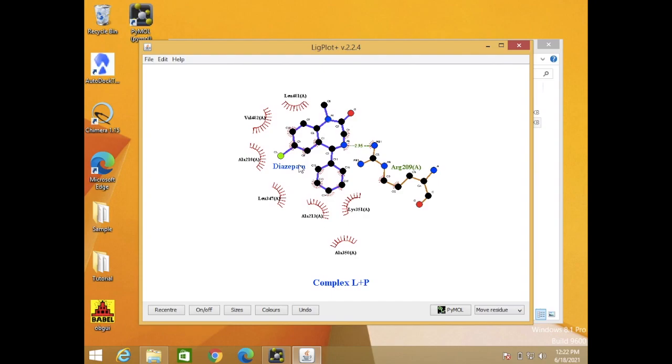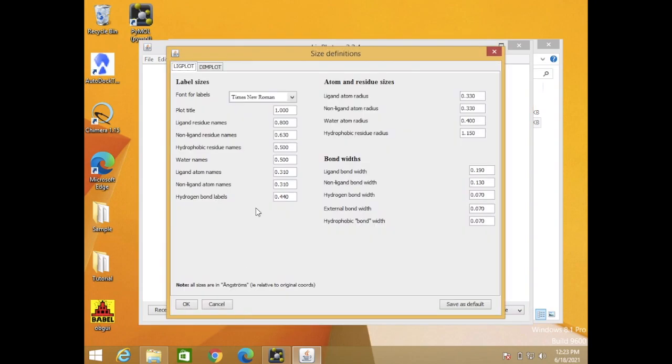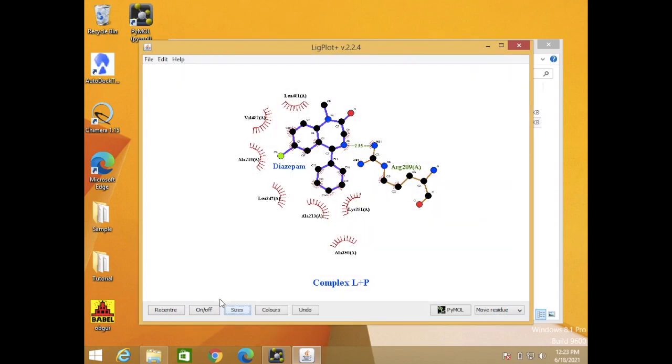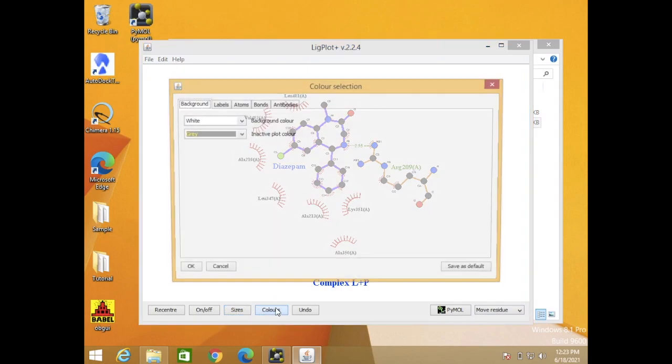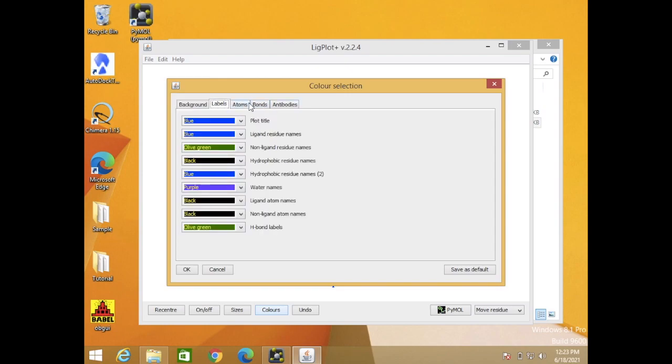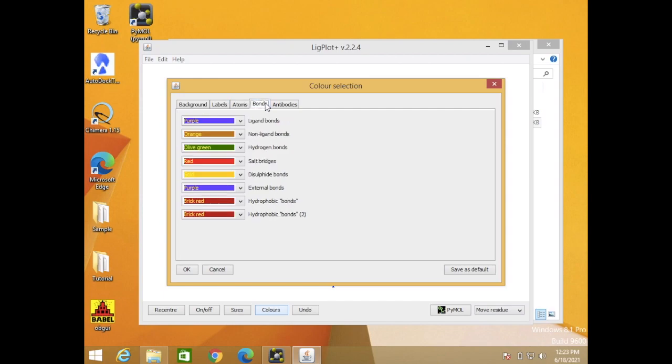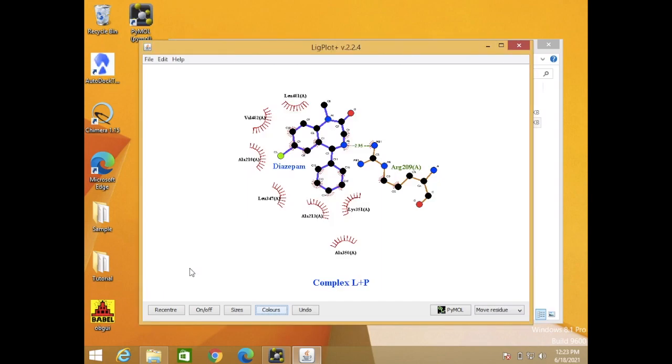For this structure, you can modify the size, the font size, and the artistic options here. You can check and then also change the color for this structure, background, labels, atoms and bonds here. You also can change these.